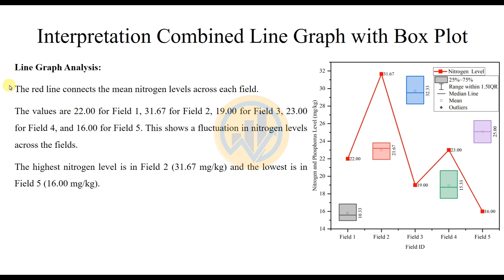For the line graph analysis: the red line contains the mean nitrogen level across each field. The values are: Field 1 — 22, Field 2 — 31.67, Field 3 — 19, Field 4 — 23, Field 5 — 16. This shows fluctuations in the nitrogen level across the fields. The highest nitrogen level is in Field 2 at 31.67 mg/kg, and the lowest nitrogen level is in Field 5 at 16 mg/kg.